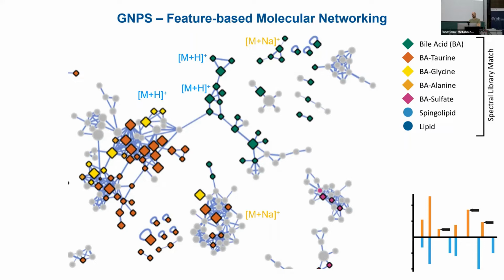You can also export for statistics and for feature-based molecular networking, but traditionally it was more the area for GNPS. By default, the GNPS export module exports peak area, but there is another export module where you can export a bunch of other information from your feature tables.